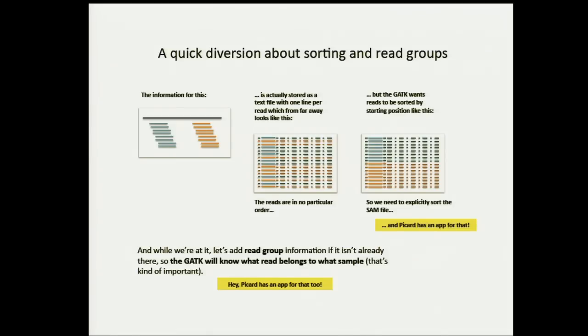So when you say the same molecule, you mean the molecule bound to the slide when the read happens? Well, if we're talking about Illumina, the cluster that gets formed when you bind the molecule to the slide, there's a small PCR reaction going there, and you multiply it several times, and then you sequence them, right? So multiple copies of the molecule will end up getting sequenced. It happens. There's a huge deal of prep to avoid this from happening, but we still get a lot of duplication.